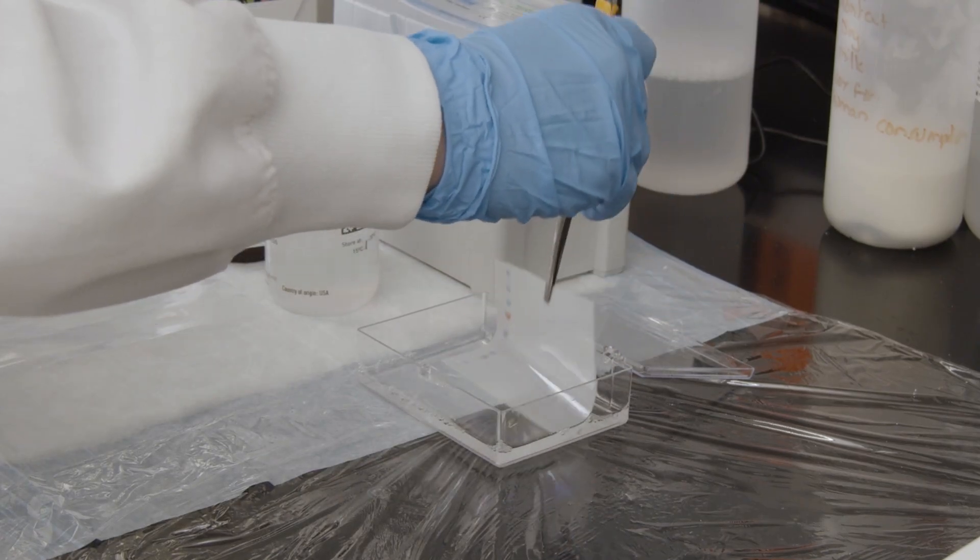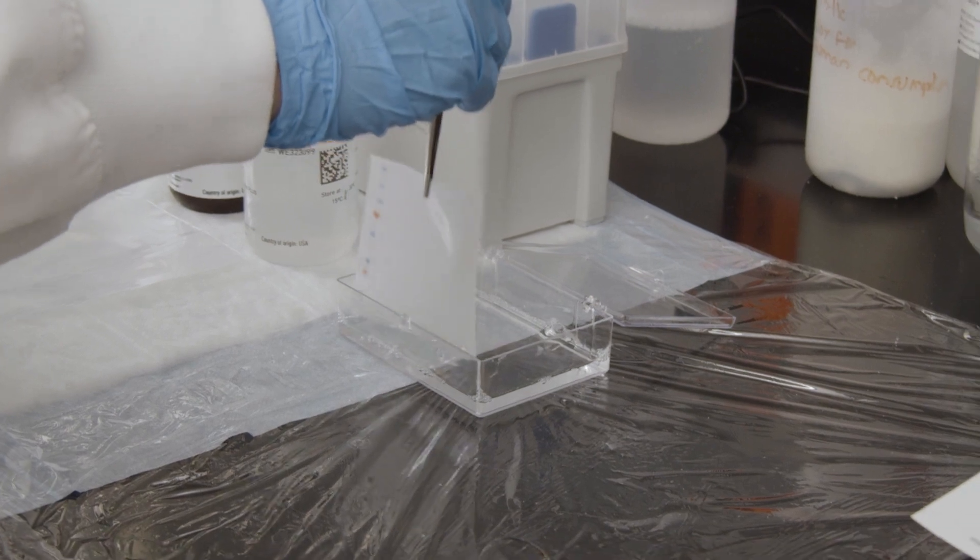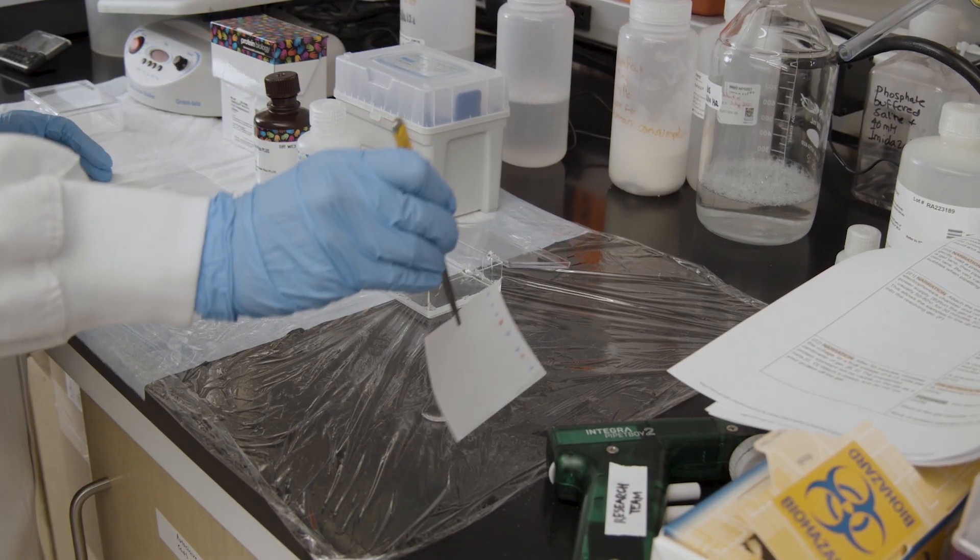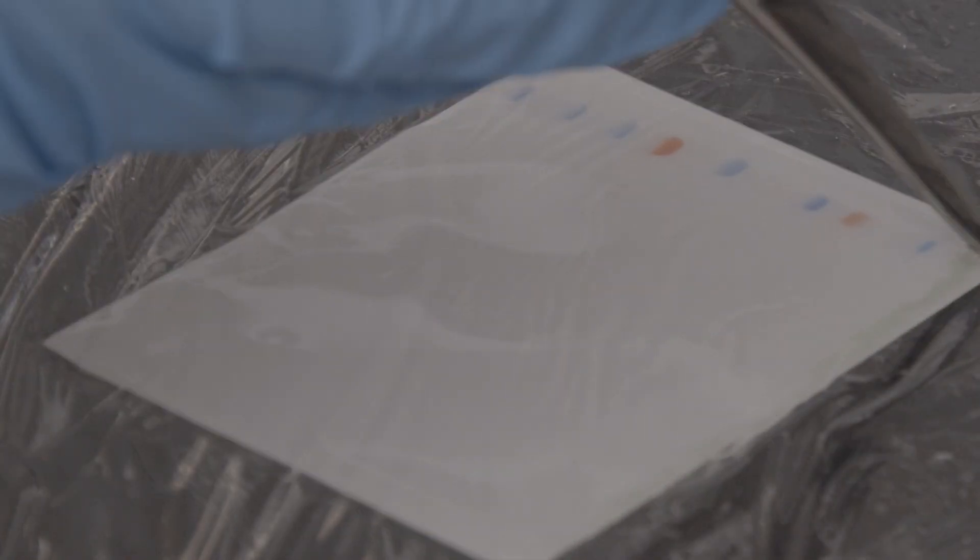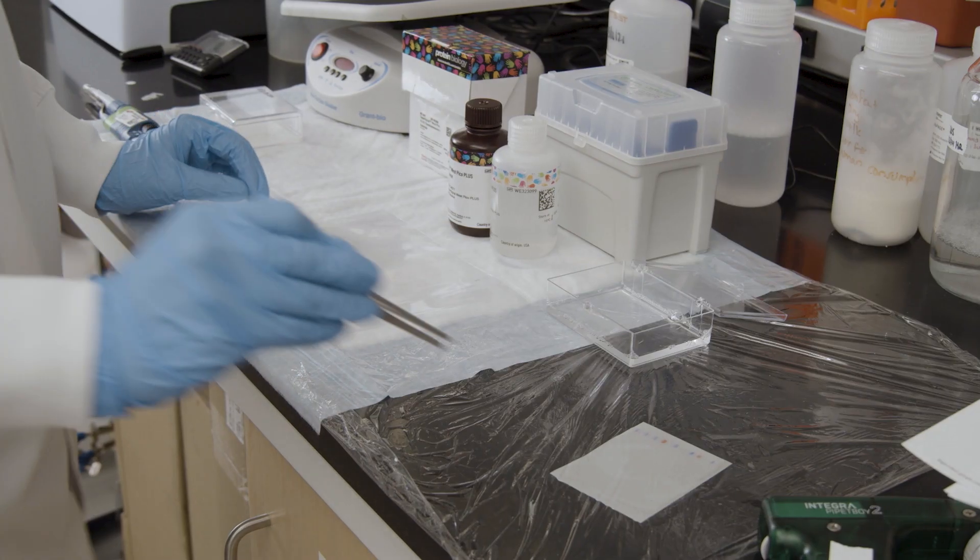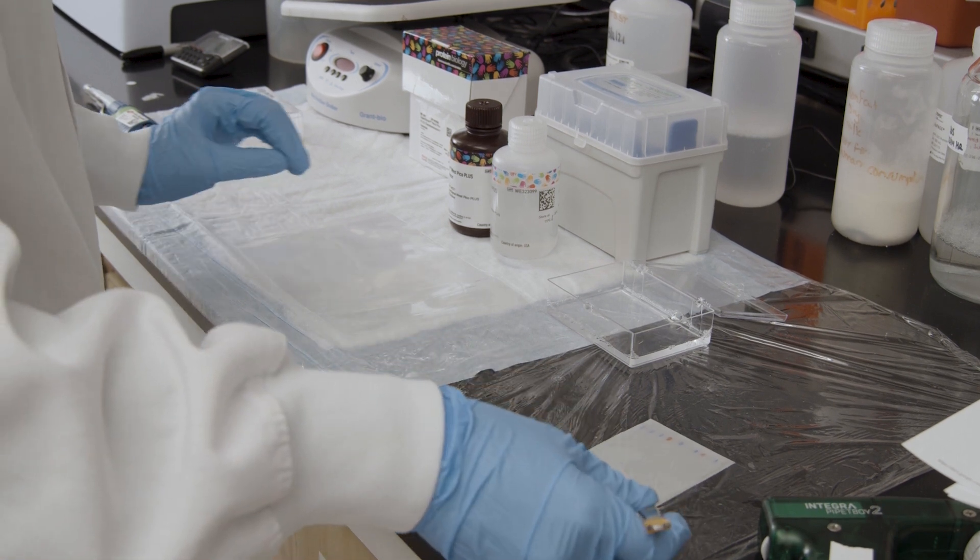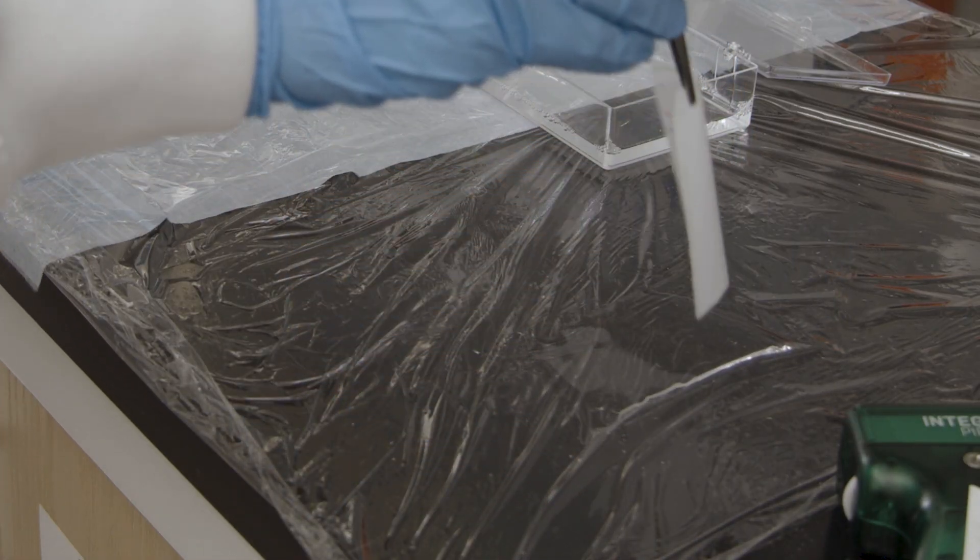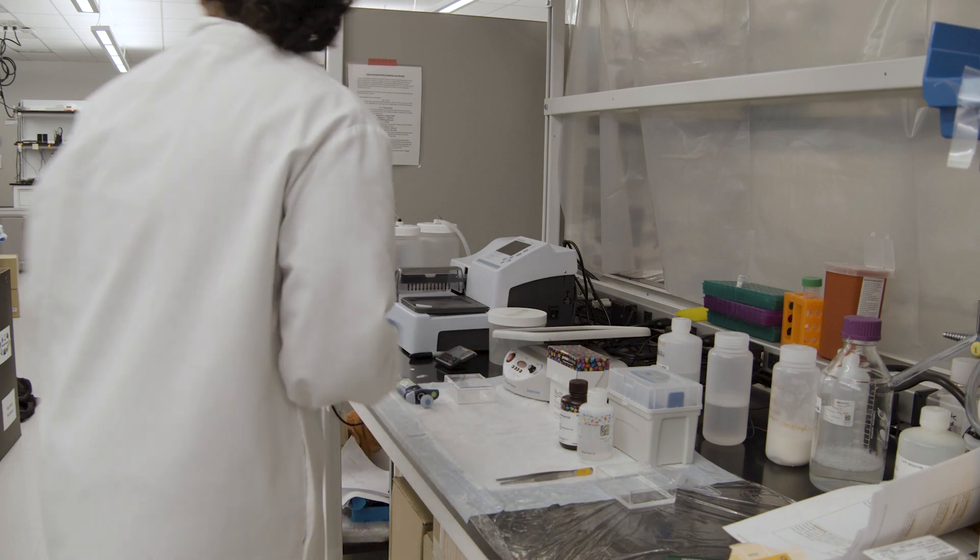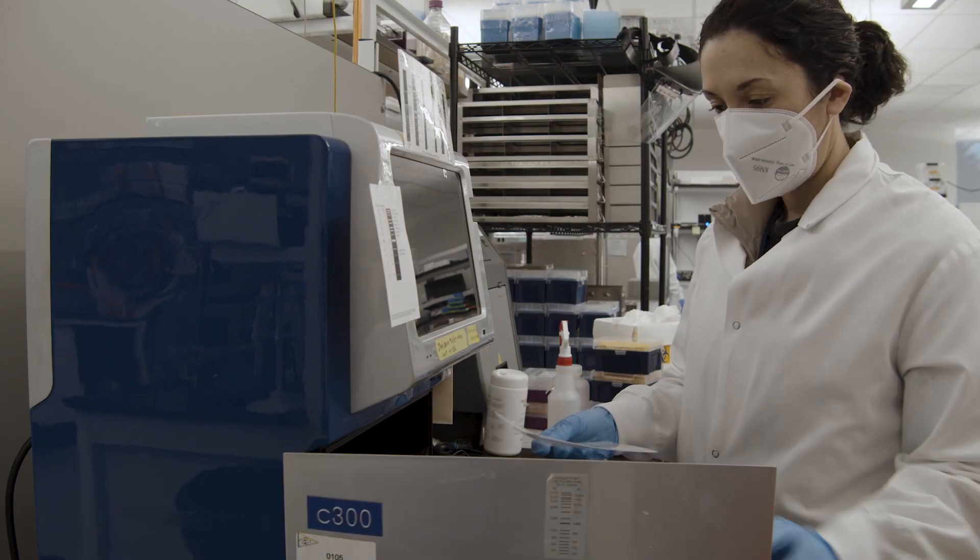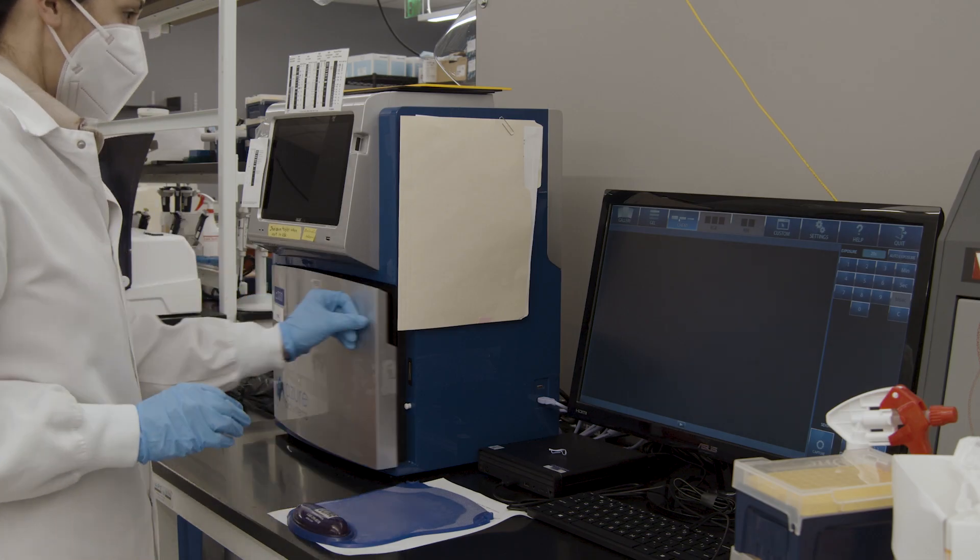Gently remove the excess wash buffer from the membrane by tapping and place the membrane protein side down into the chemiluminescence substrate. Using the forceps, gently tap the excess chemiluminescence reagent off the membrane and place the membrane protein side up in a clear sheet protector.